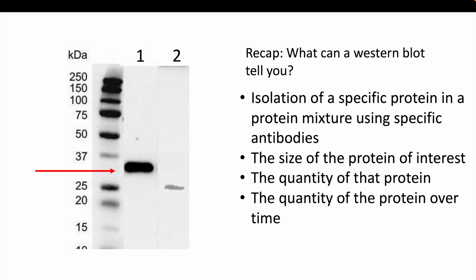To determine the size of the protein, we can use the ladder for reference. Column one is between our ladder 37 and 25 kilodoltons, so we can assume that our protein of interest in column one is probably between 36 and 35 kilodoltons in size. As you can tell by the band in column two, there is a smaller concentration of that protein, but you can tell that the size is 25.